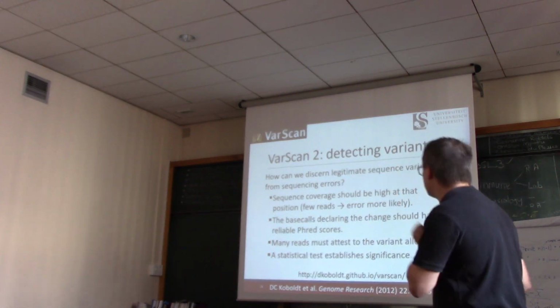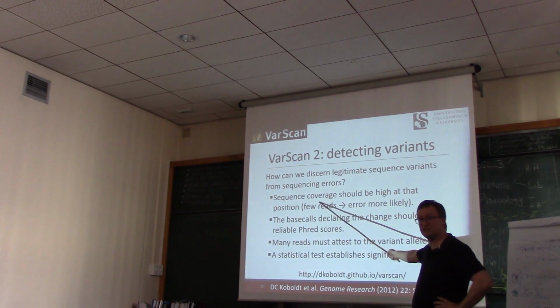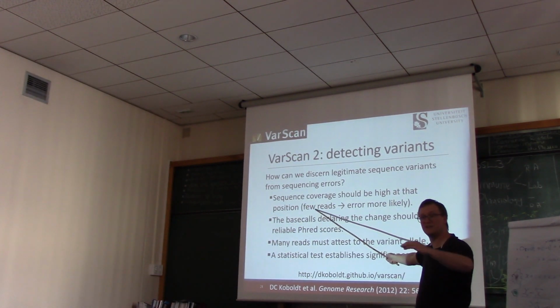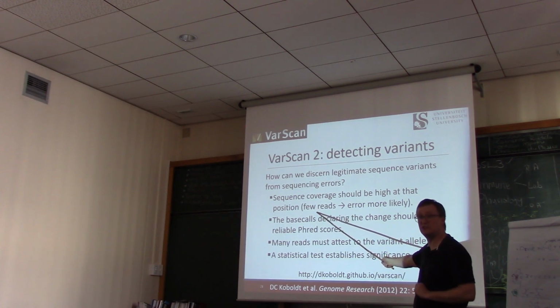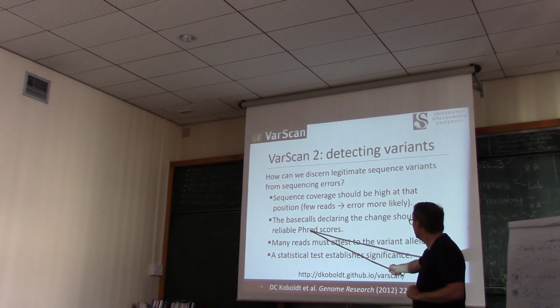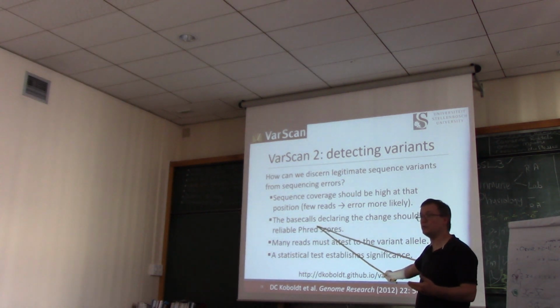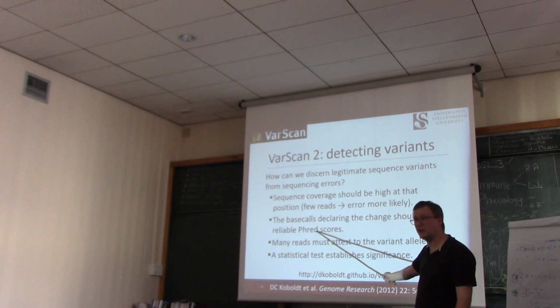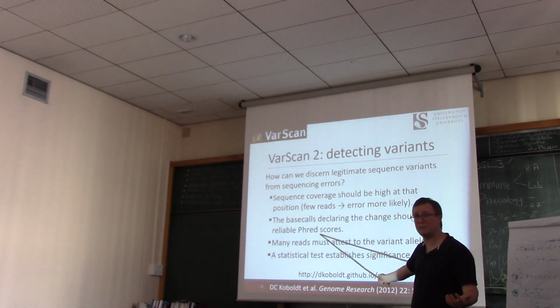All right, so how do we determine that we have detected a variant? There are many different rules that we might use for this. One is that we want to have lots and lots of reads, all covering this from different perspectives, that make us very, very sure that this person has an alternative sequence at this position. If we're relying on these base calls, if they're all given with a score of 20, we're going to disregard that. But if they have scores of 40 and 50, well, we're going to feel a whole lot better about that.